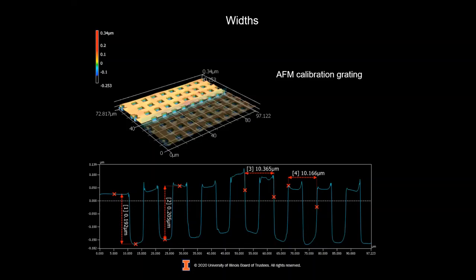So a lot of people will end up using an instrument like this in an industrial environment where you're doing the same sort of sample over and over, and you want to have a repeatable protocol and just come out with a report on the first sample that you measure and the 500th sample and the 1000th sample, without having to pay some poor tech to sit there and do the same thing every time. So automation is a part of the software on most of these that you can buy.